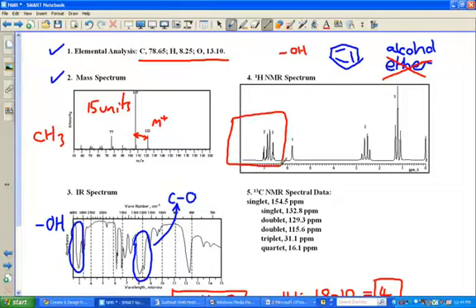It's not so much that we have a set of peaks there, because we knew we were going to have that, because we knew we had the benzene ring. What should be of interest is their shape or multiplicity. Notice there are 2 2's here. And that specifies 2 separate peaks, 2 different peaks. One here and one here.